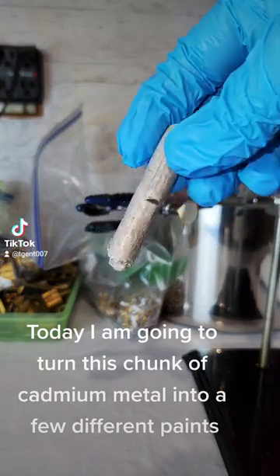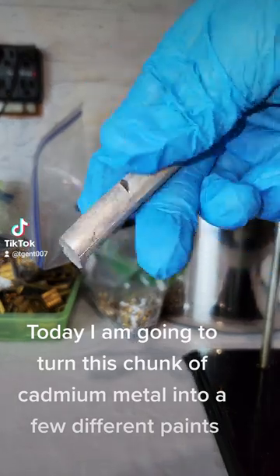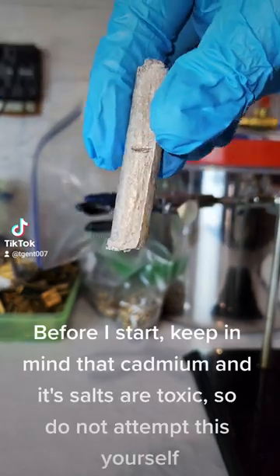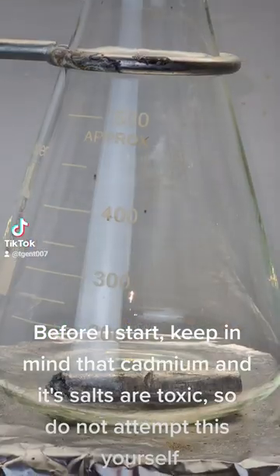Today I am going to turn this chunk of cadmium metal into a few different paints. Before I start, keep in mind that cadmium and its salts are toxic, so do not attempt this yourself.